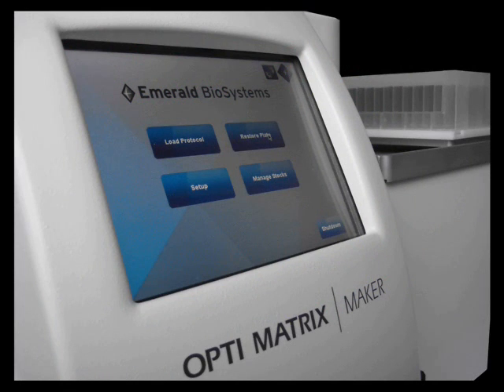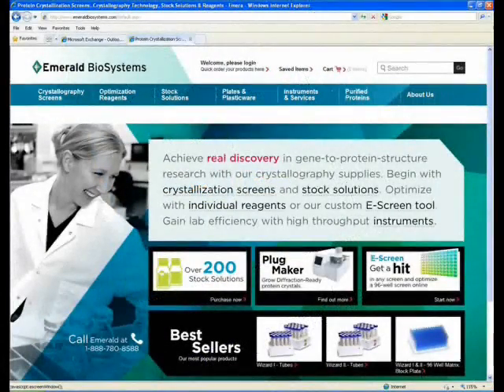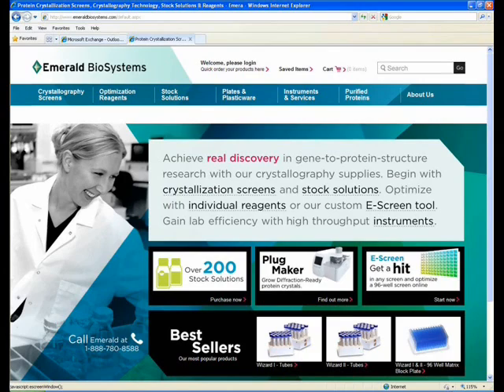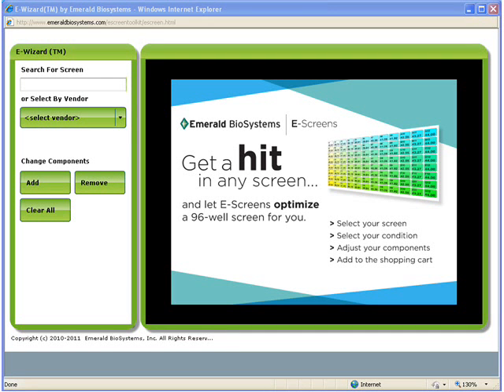Creating a screen with the OptiMatrixMaker begins with the eScreenBuilder at emeraldbiosystems.com. eScreenBuilder is the tool used to design a fully customizable screen in a matter of a few clicks. As an example, I will design an optimization screen based on condition A1 of Wizard3.